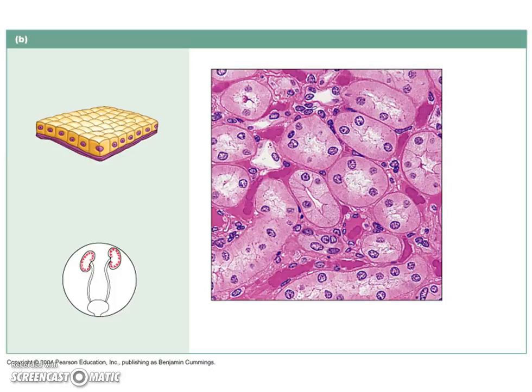Let's look at another epithelia. We're actually going to the third one in your chart. This is one layer of block-like cells, so it's simple cuboidal. Where are we finding them on the slide? Well, each one of those little round circles is one layer of cuboidal cells, and you see the space in the middle. It kind of reminds me of wagon wheels, so you can write what description you want down that'll help you remember this is what simple cuboidal looks like later.